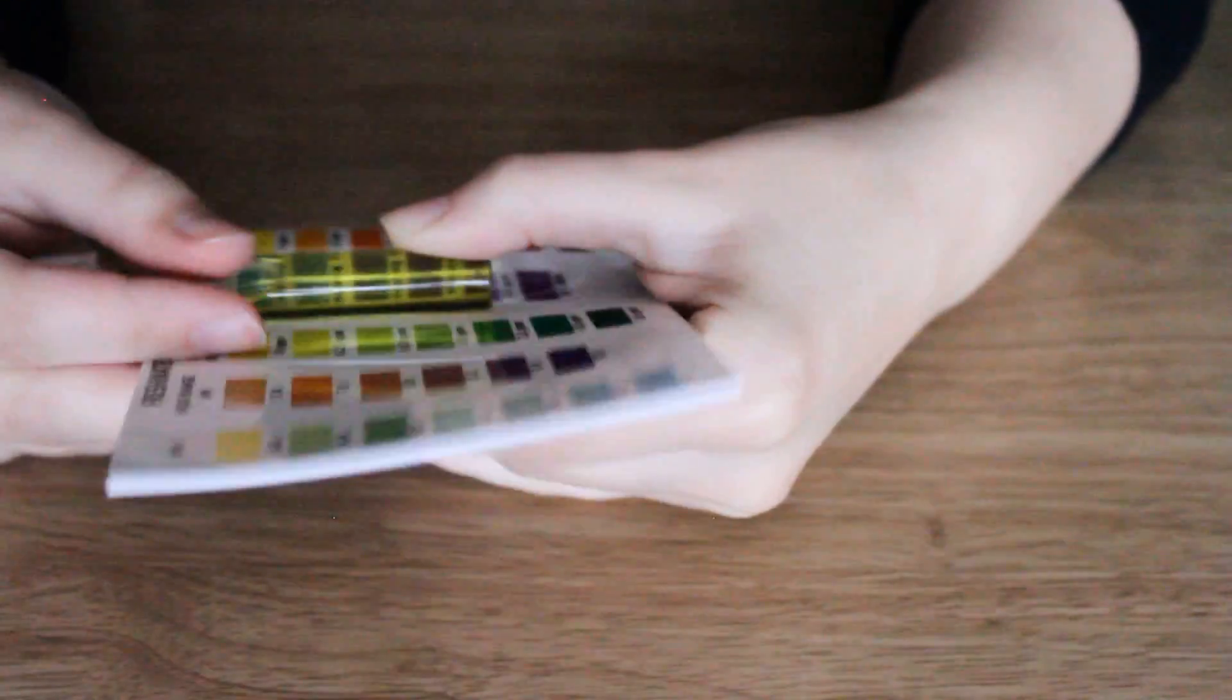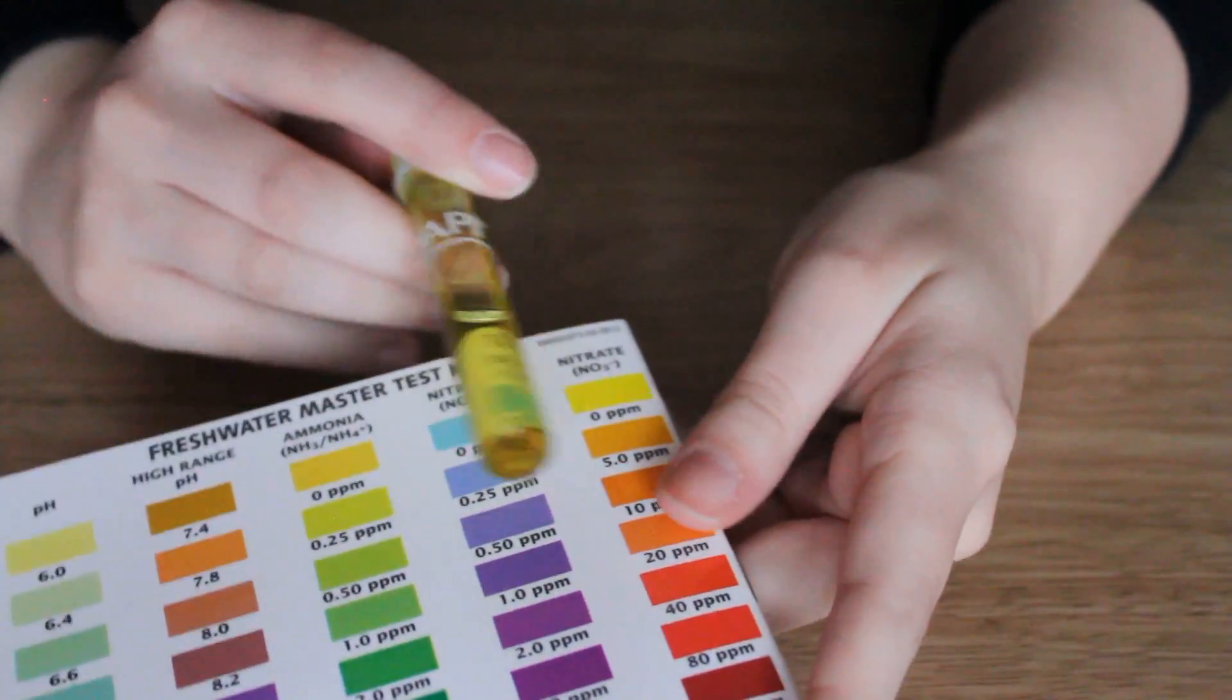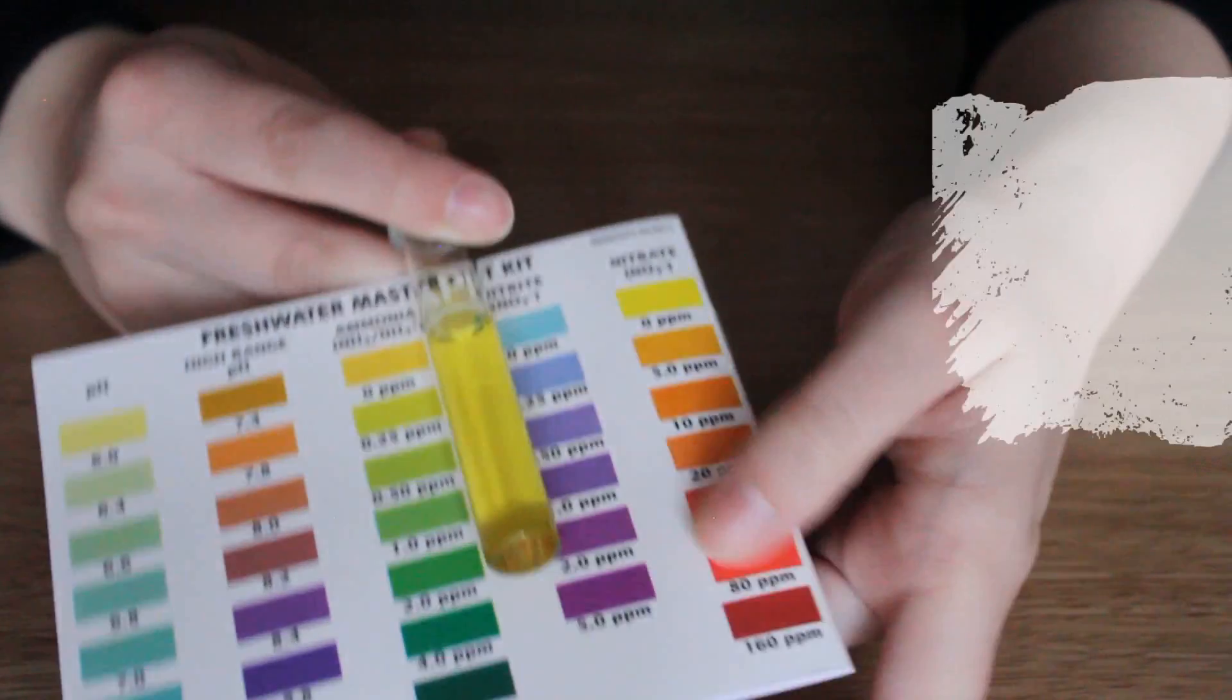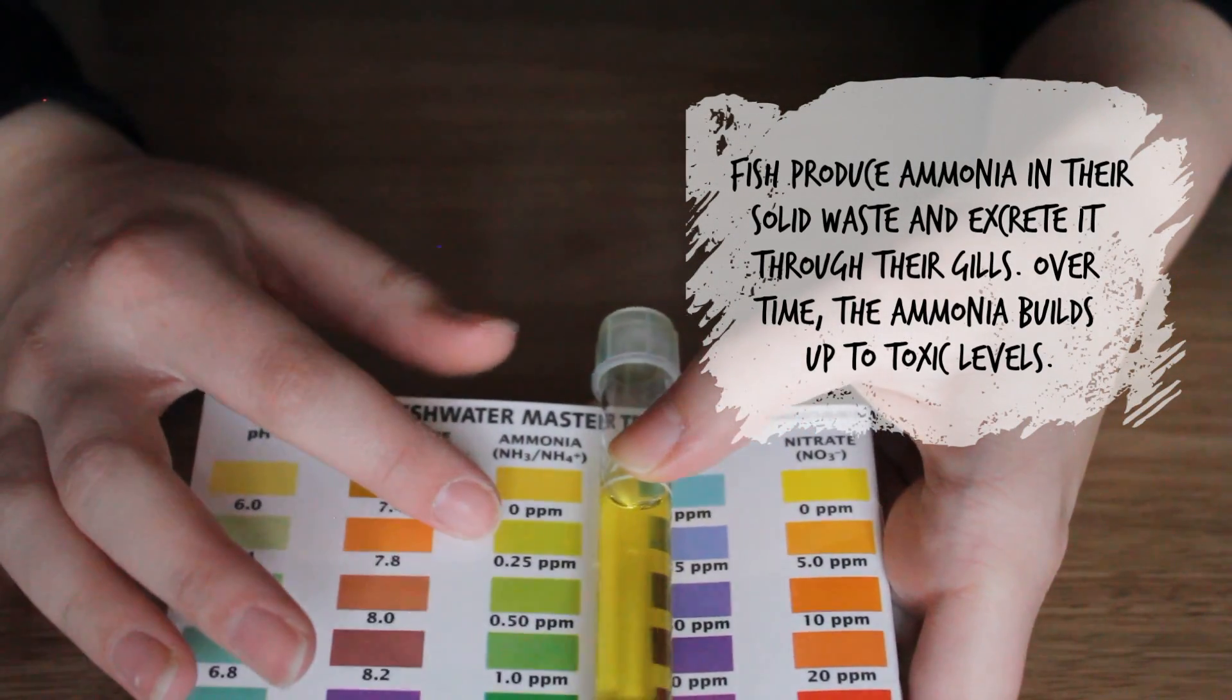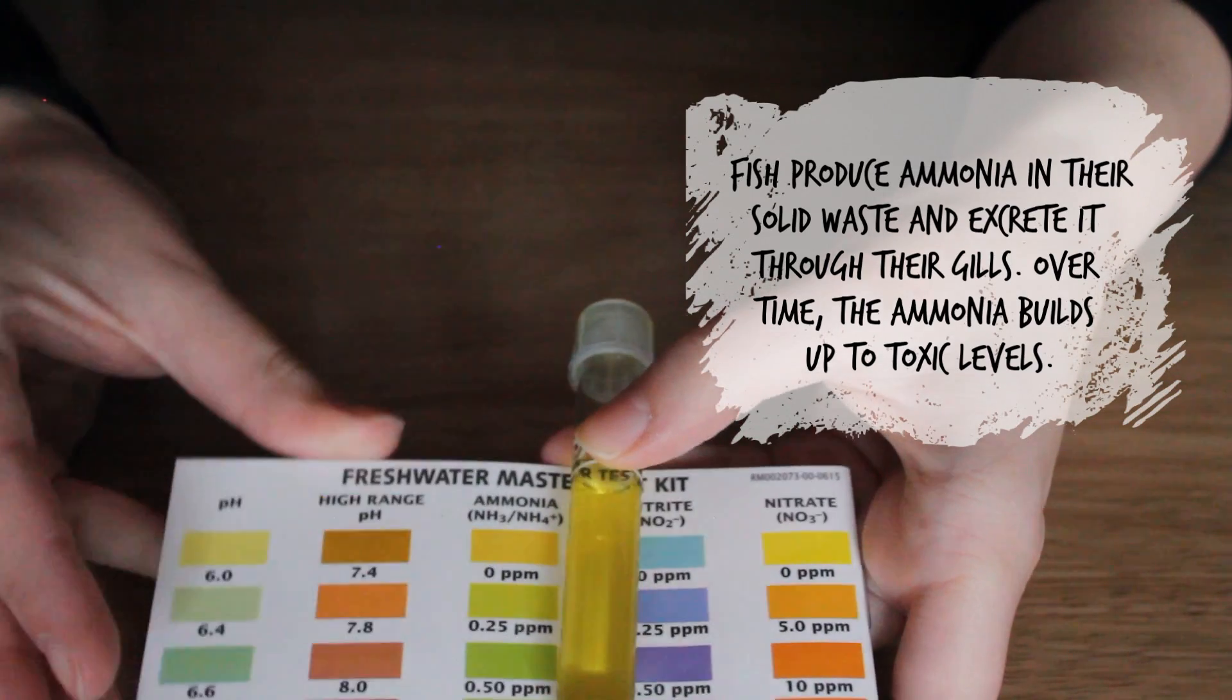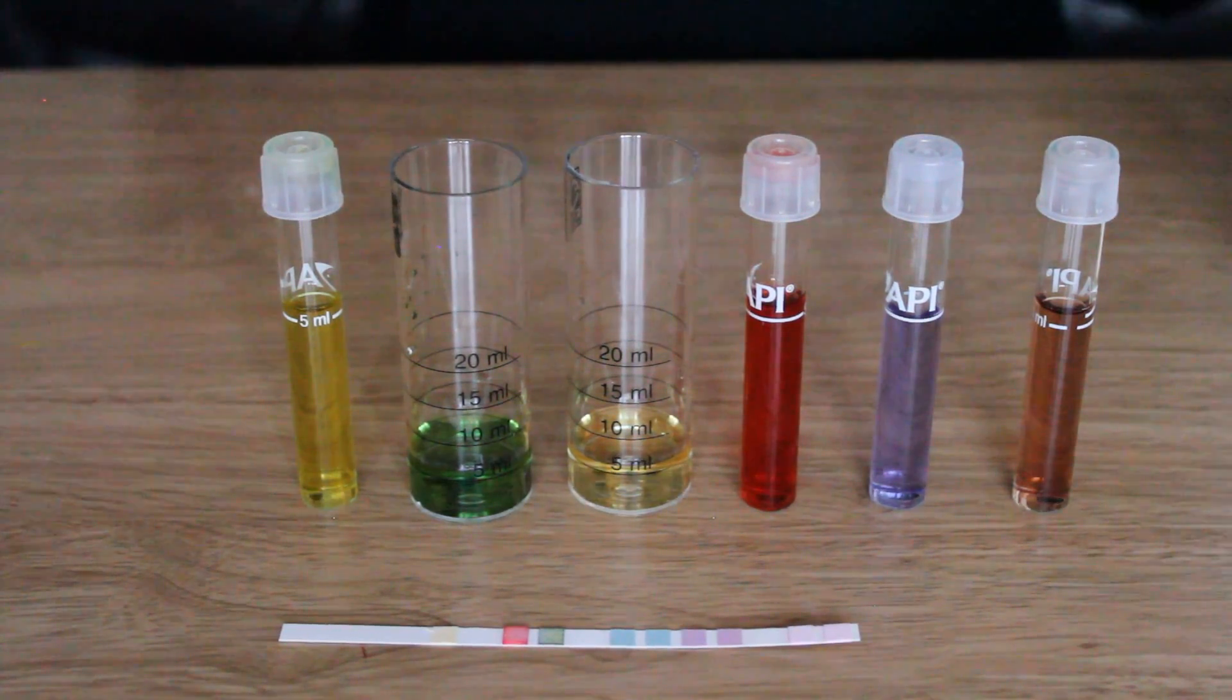It's been quite a long time and the sun's going down through the clouds. The ammonia test is actually looking rather good. It's looking at maybe zero to 0.25, it's very yellow in person, so at least we have one good result after all of this.